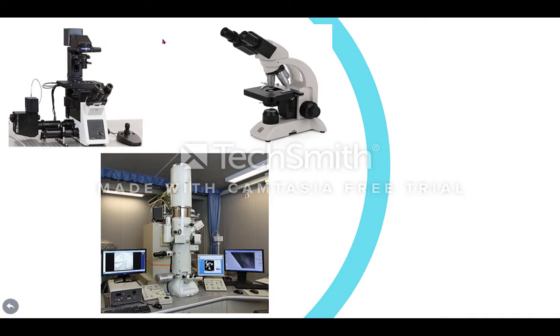With the confocal microscope, the observer is able to observe the specimen in real time. Cell functions and processes can be observed, unlike the access an electron microscope offers. An electron microscope shoots a beam of electrons into a vacuum where the living specimen wouldn't be able to survive. So although it's more powerful and it gives closer images of cells, it still wouldn't provide a look into cellular function.